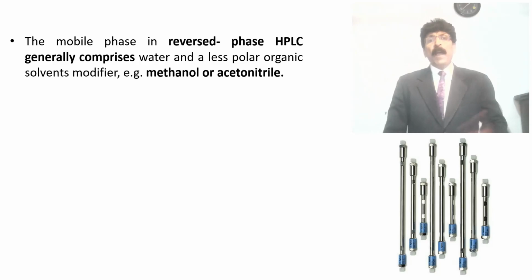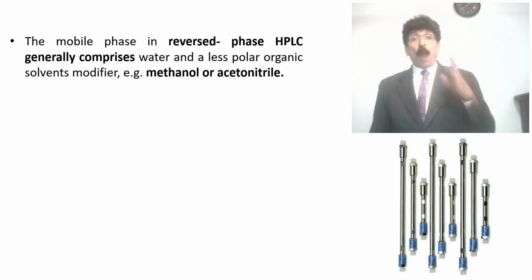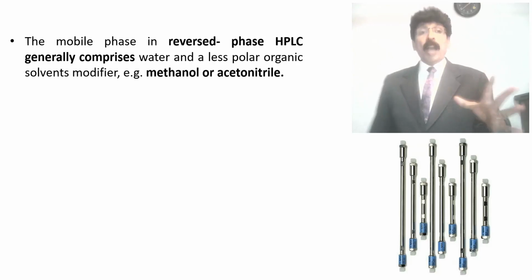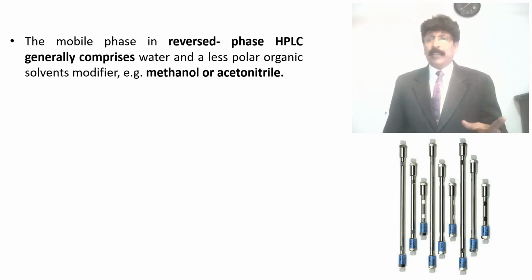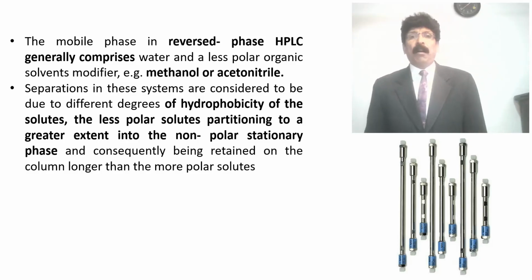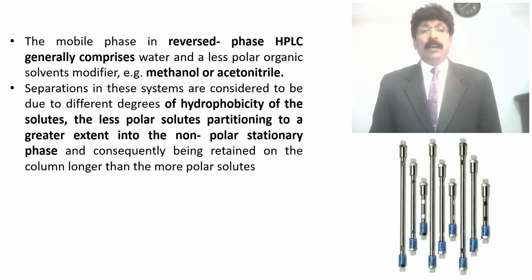The mobile phase in reversed phase HPLC generally comprises water and a less polar organic solvent modifier, for example methanol or acetonitrile. The separation in these systems is considered to be due to different degrees of hydrophobicity of the solutes.